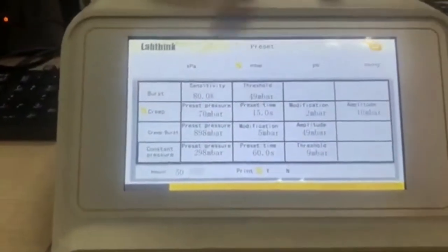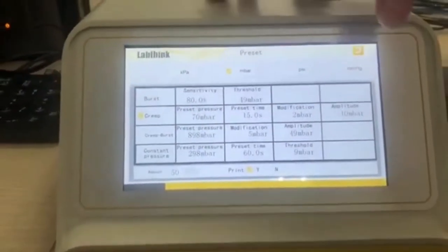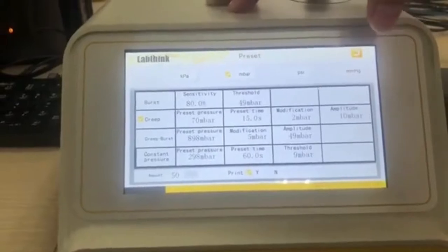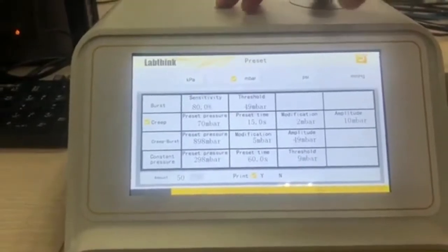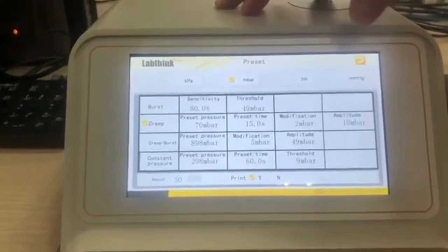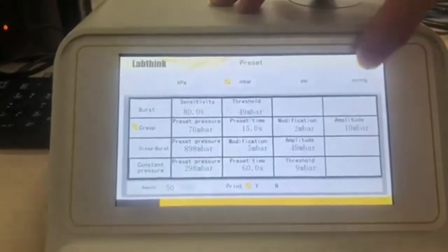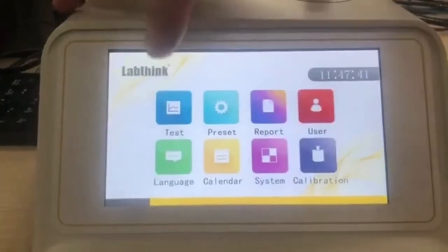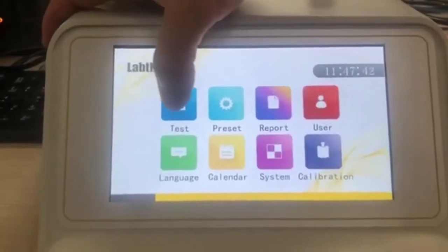Okay, now we finish the parameter setting. Come to the test.